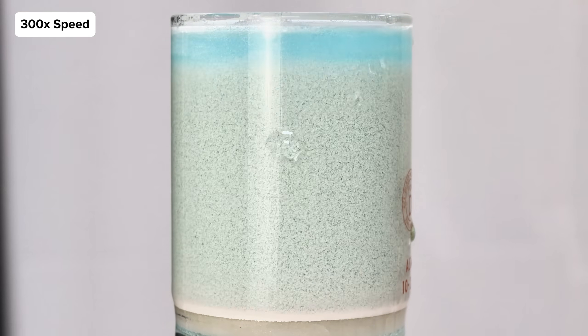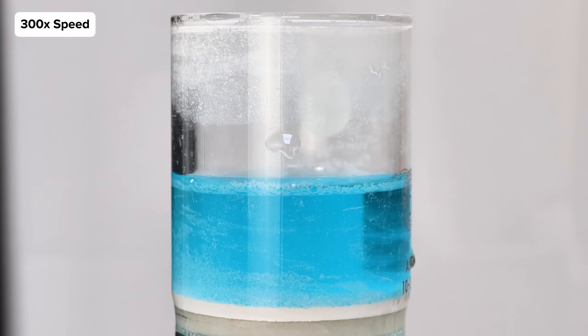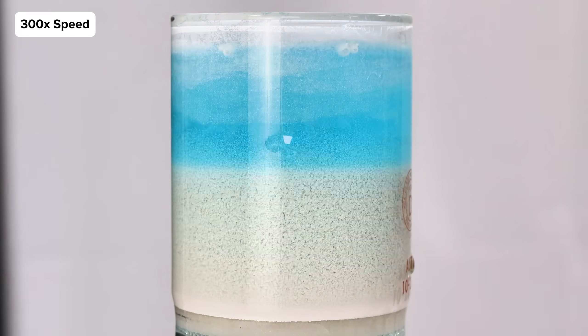This left me with a small puck of pure copper iodide which I scraped into a watch glass and set overnight to dry.